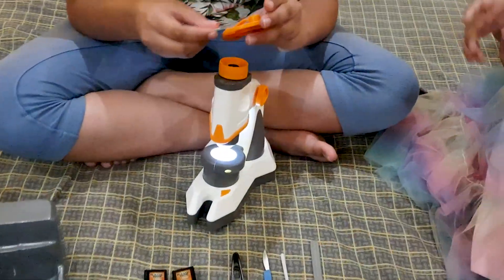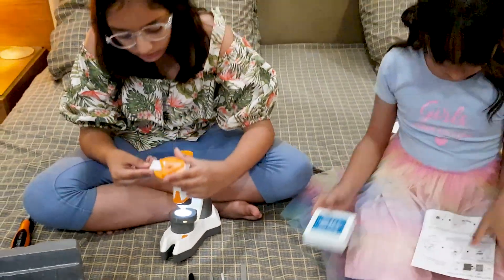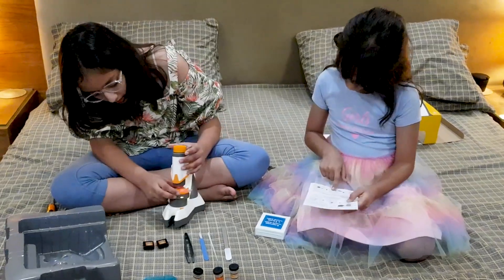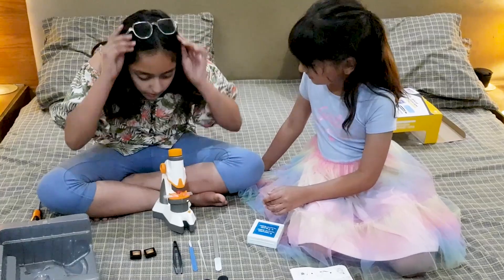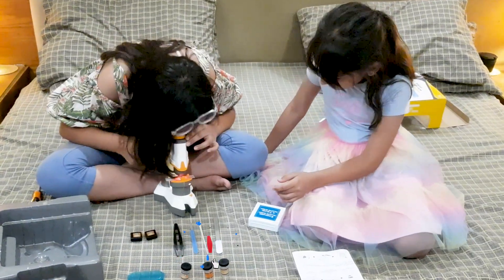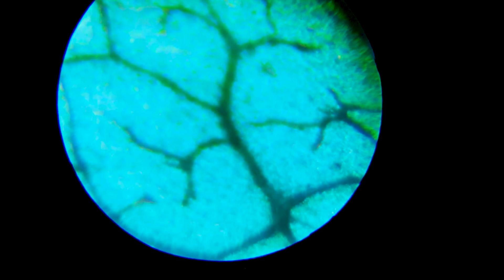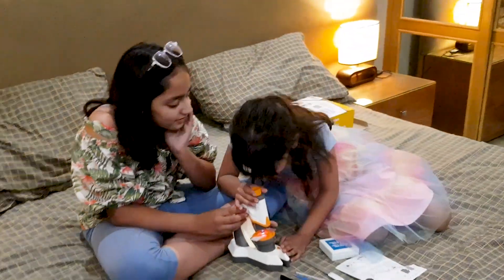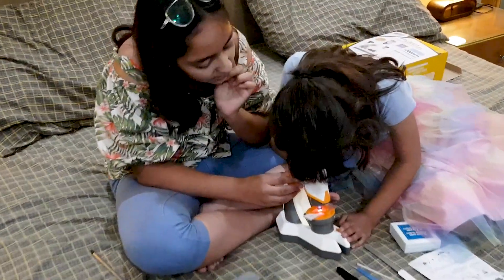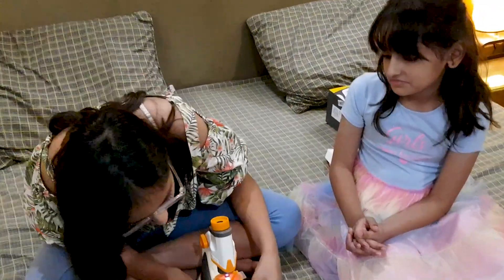What is this? I think you have to do like this. Let me check on the instructions. Yep, then you have to put it in. Yeah. So cool, literally. Yeah. Woo. It's so cool. Whoa. I don't know if you can. Let's try another one. Yeah, that one.